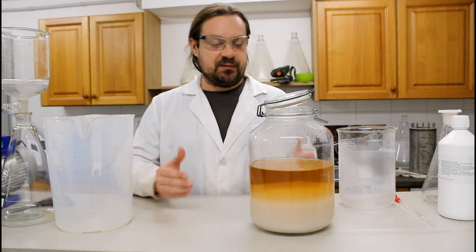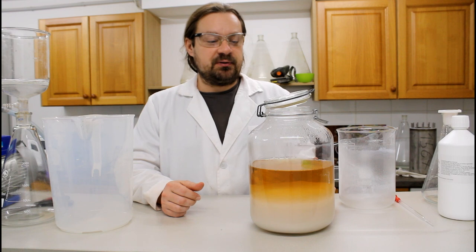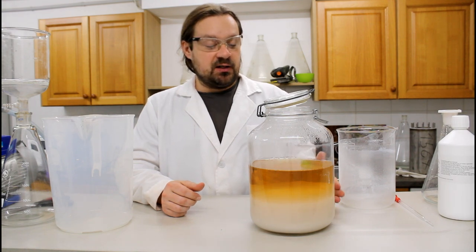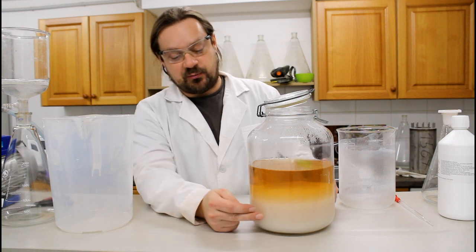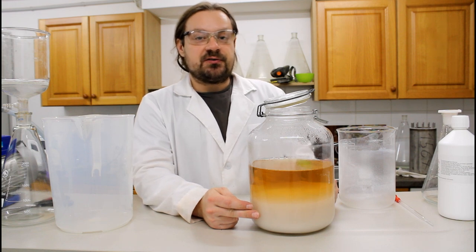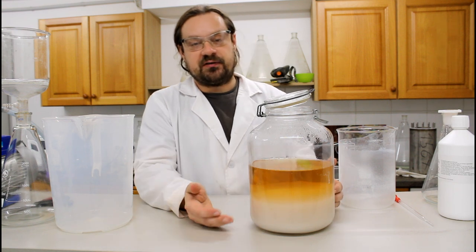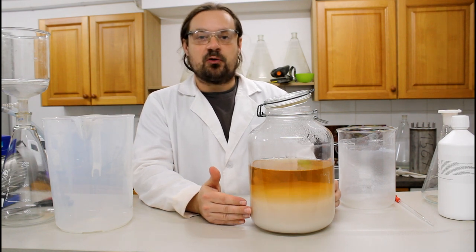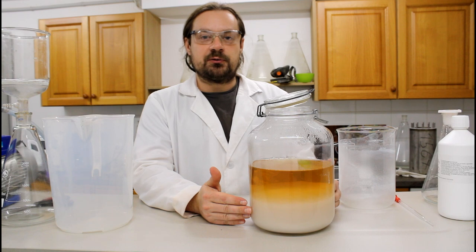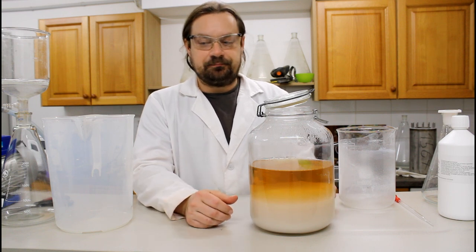Okay, as you see, the precipitation is done, and the final steps that we are going to do today is to filter that stuff. We want to have that white precipitate here because this is where supposedly the precious elements are in, and the top water we can simply discard. And then we are going to dry this precipitate overnight, and tomorrow we are going to continue extracting the precious elements out of this precipitate.